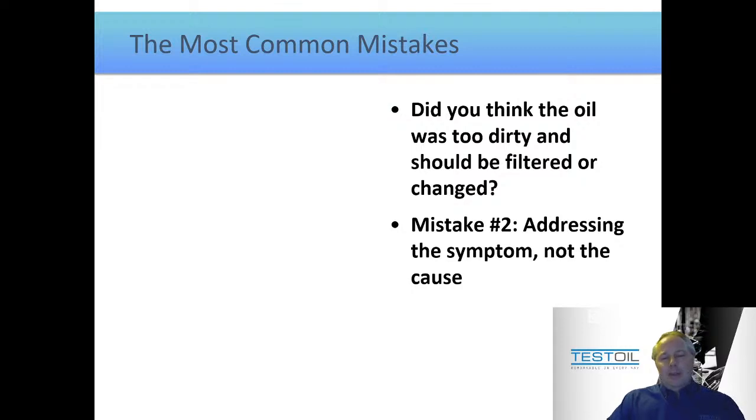So we need to be aware that we should identify why it's being contaminated and go after that so that once we filter it, it will stay back in shape. And that's one of the big issues that I have with the way a lot of people interpret their oil analysis reports is that they simply change the oil. Right? As soon as a report looks bad, they change the oil, which guarantees that yes, probably the next report will look good, but that doesn't mean you fixed anything mechanical or logistical with why those samples are looking so bad and what's being damaged or degraded.